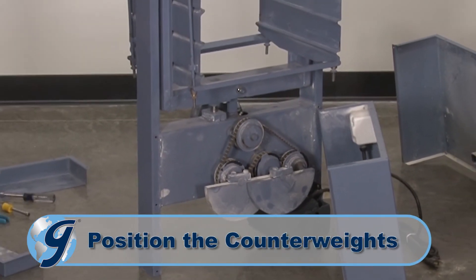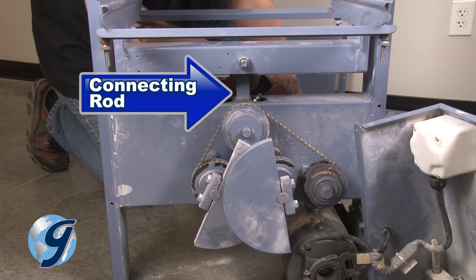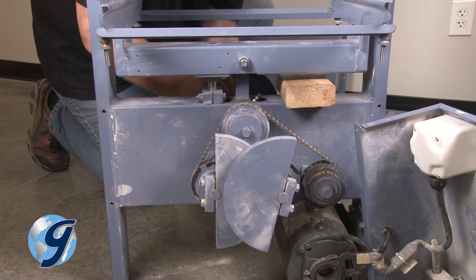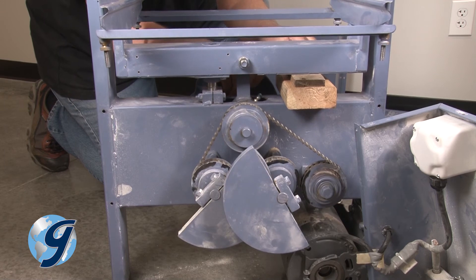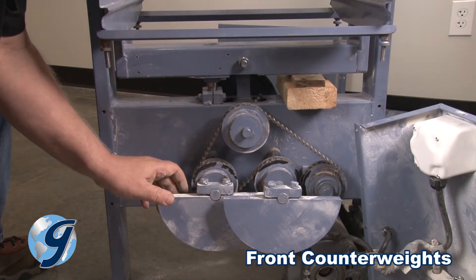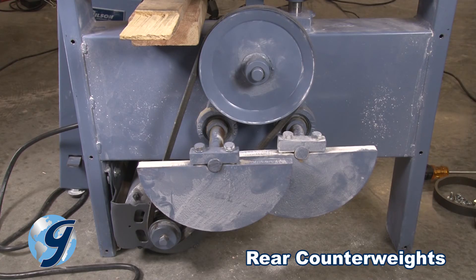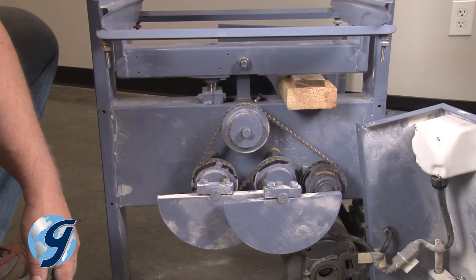To properly position the counterweights, rotate the driveshaft until the connecting rod is at its highest point. Use a wedging device to hold the driveshaft in place. Loosen all counterweight screws until all four counterweights in the front and rear are in proper position, flat side equally up, and then tighten all counterweight screws.